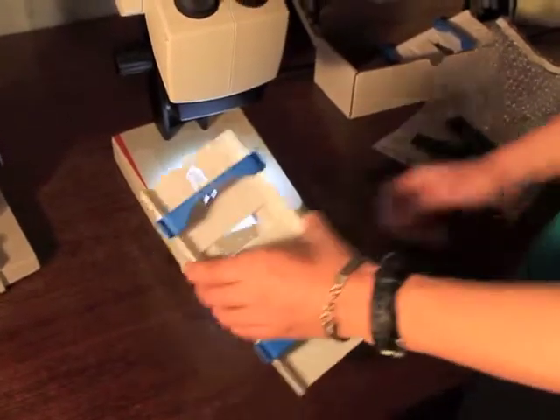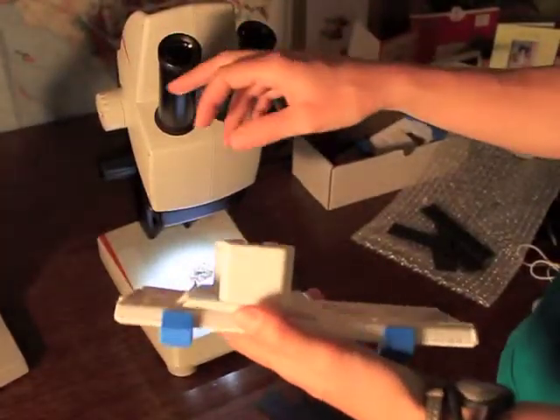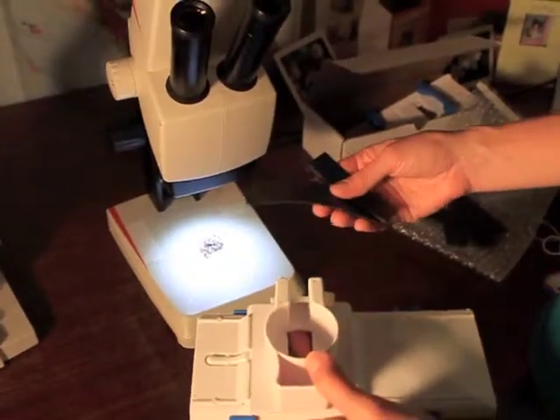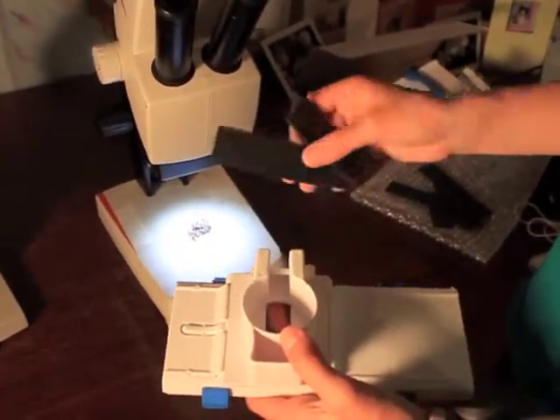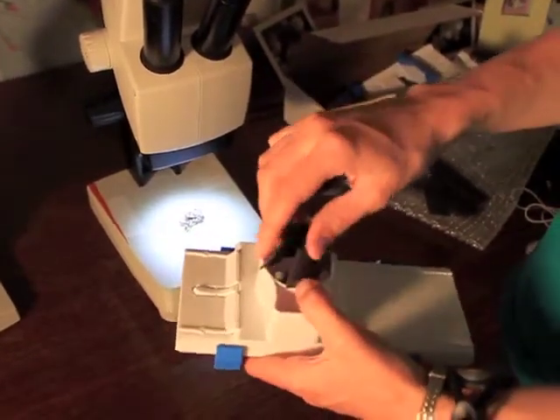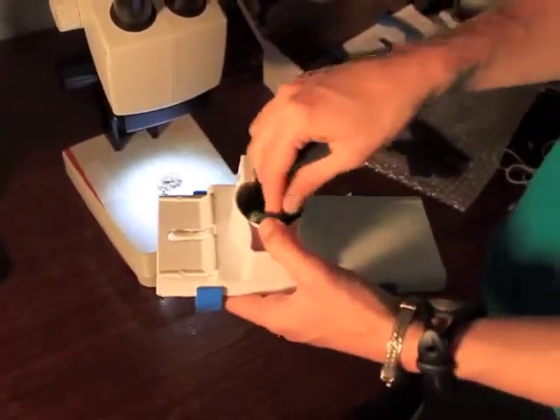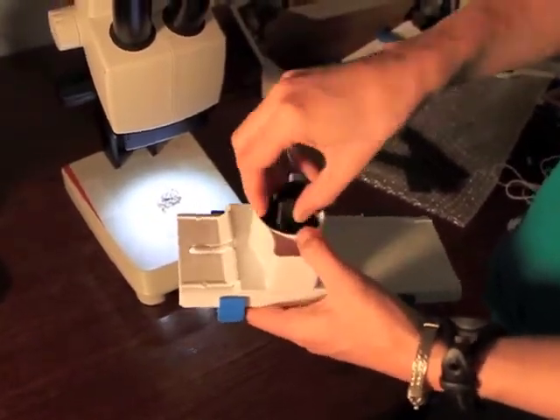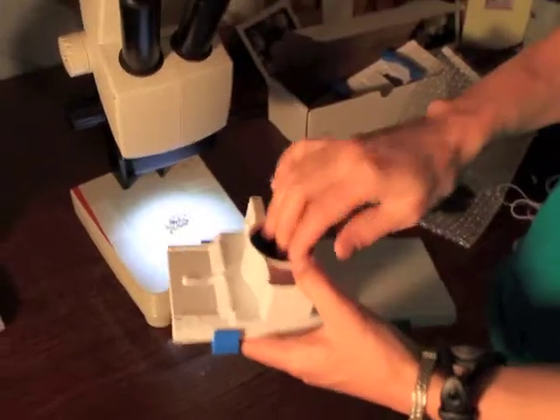The next step is to put the skylight on to the microscope eyepiece. In this case, the eyepiece is a little bit on the small side, so I've picked out some inserts — the rubber inserts I mentioned before. What I like to do is actually just slide the inserts into the base of the skylight, and just slip them in there like that.